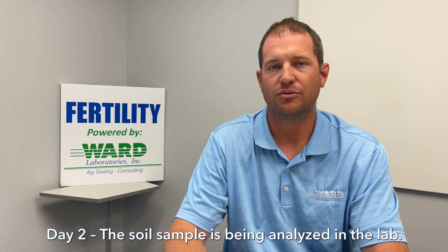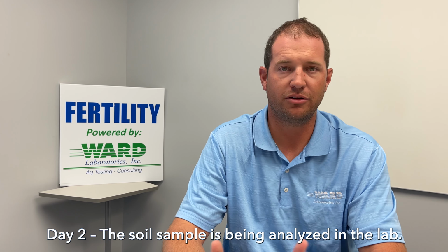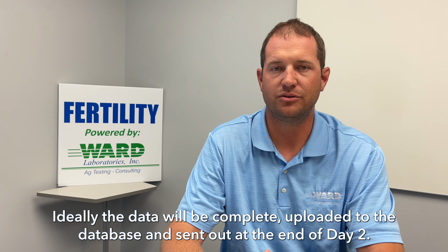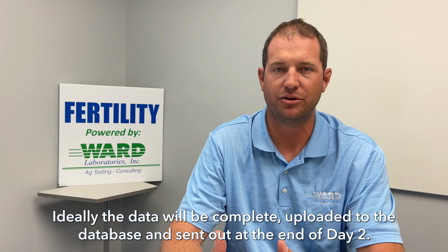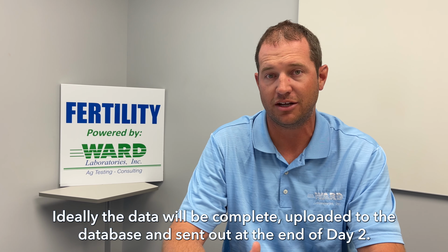More likely, that's the start of day two, we have test tubes of extractant or cups of soil. We begin running those in the lab. And the ideal is to compile all that information, upload it to the database, build the reports, and send that out on the end of day two.